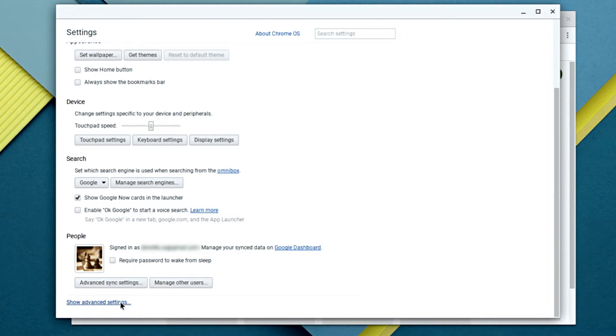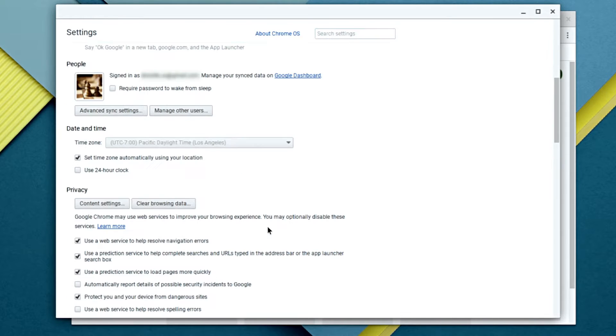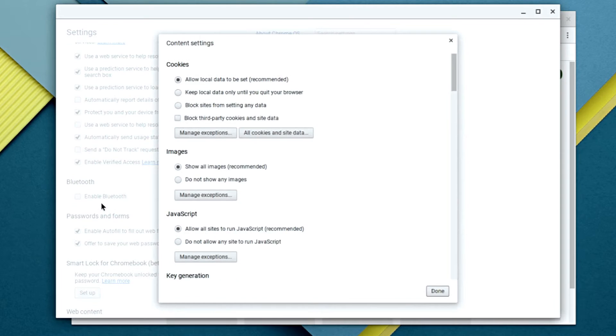At the bottom, select Show Advanced Settings. And under Privacy, click on Content Settings.